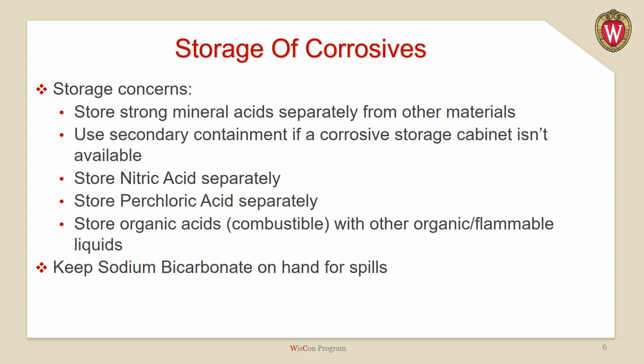Storage of corrosives. Storage concerns: store strong mineral acids separately from other materials. Use secondary containment if a corrosive storage cabinet isn't available. Store nitric acid separately. Store perchloric acid separately. Store organic acids, which are combustible, with other organic flammable liquids. Keep sodium bicarbonate on hand for spills.